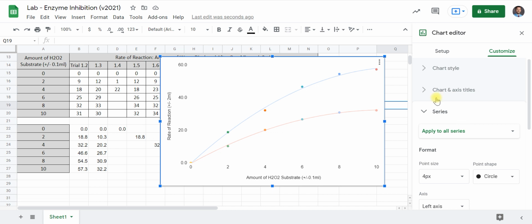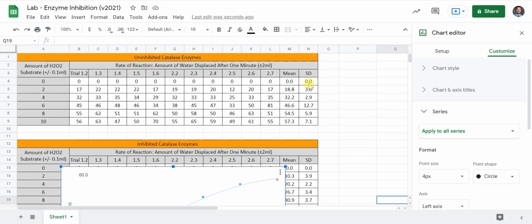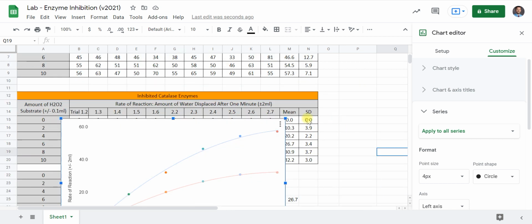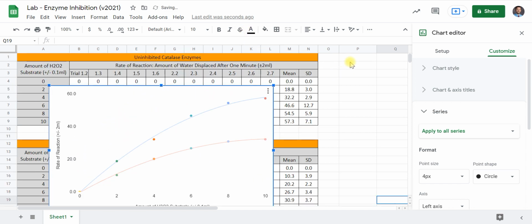Next thing, and the last thing we need to do, we have our trend lines. We have our 2 individual rows of data, or our 2 individual trends. The last thing we're going to need to do is apply error bars. And these are a little frustrating to do. And the reason why is each data point here at the bottom, each individual data point has to have its own error bar correspond to the standard deviation. And so the way to do this, it's a little time consuming, but it's really not too bad.